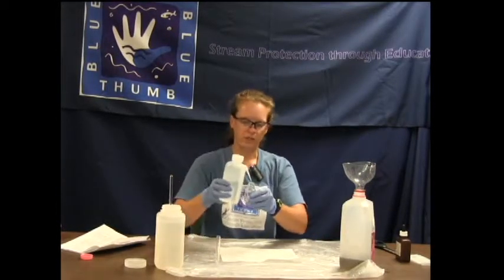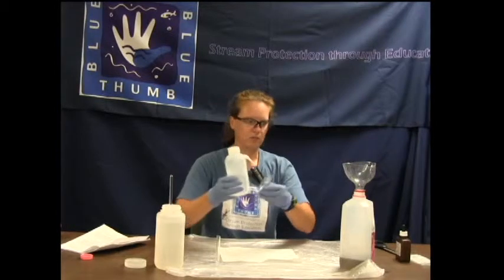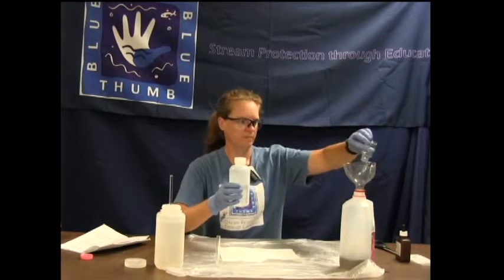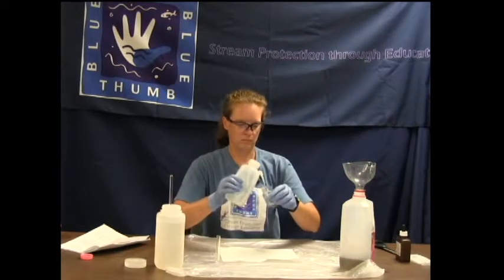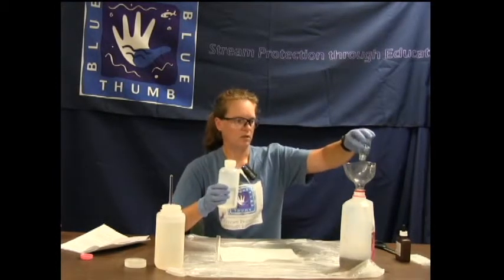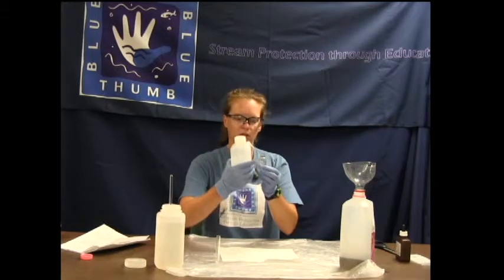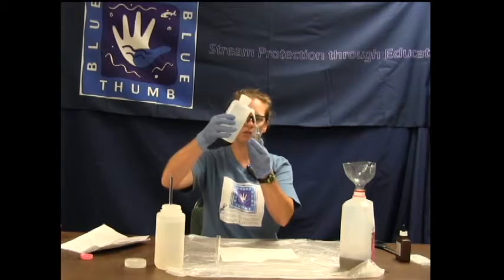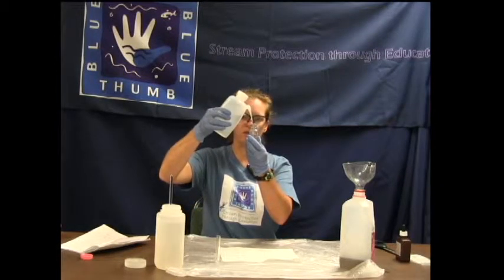So always do the blank first. Rinse the square mixing bottle three times with deionized water. Then fill it up to the 23 line — that's the top line on the square mixing bottle — with deionized water. Always fill at eye level.